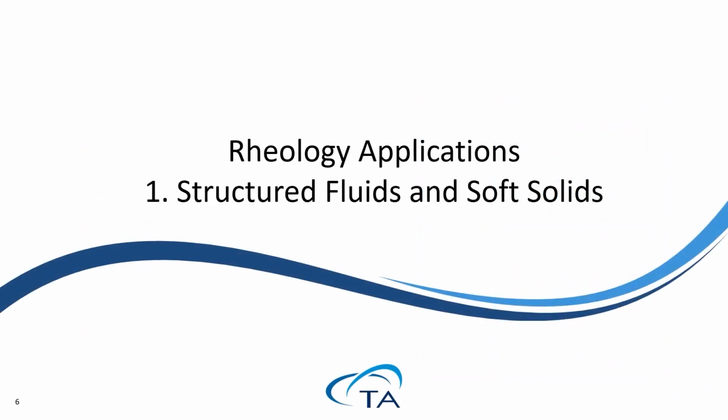Now we have learned the basic theory of what is rheology, how a rheometer performs rheological measurements, and also how to program all of the different kinds of rheological test methods to measure the viscosity and viscoelasticity of your sample. Now let's talk about rheology applications. How do we use rheological test results to help you with your research? In this first section, we're going to talk about rheological applications to structured fluid and soft solid.